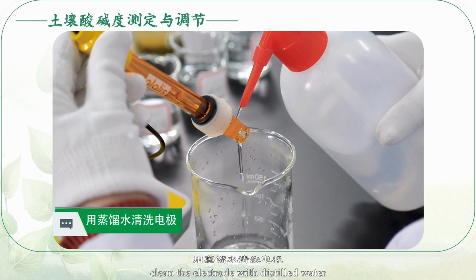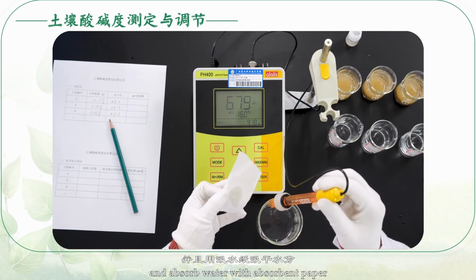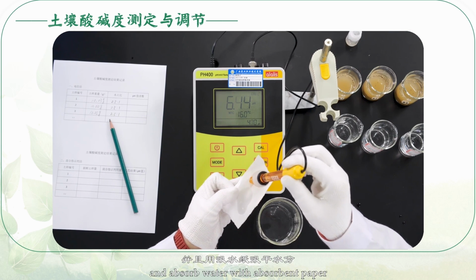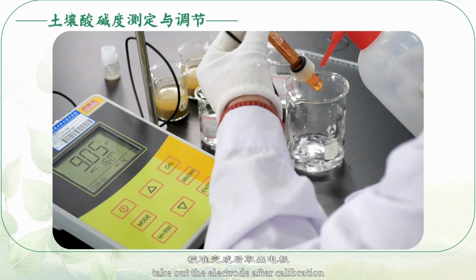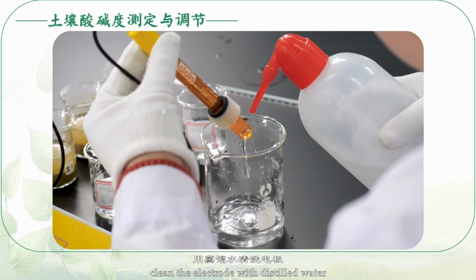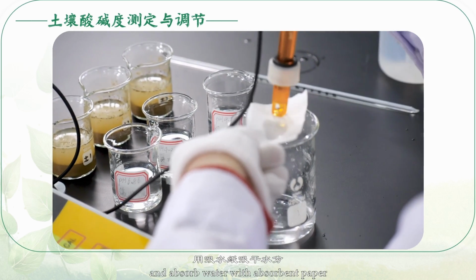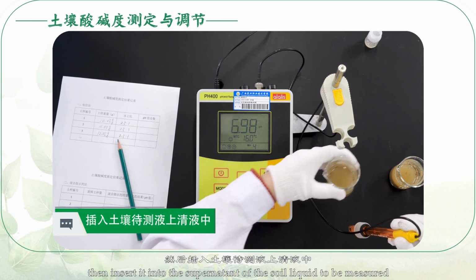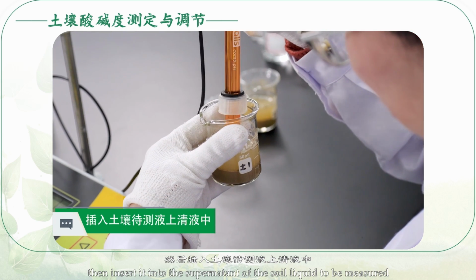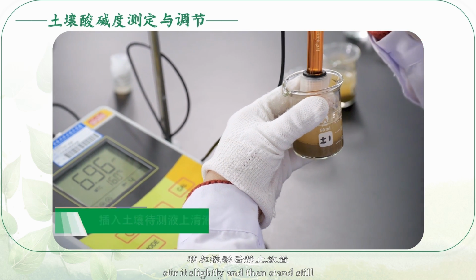Clean the electrode with distilled water and absorb water with absorbent paper. Take out the electrode after calibration. Clean the electrode with distilled water and absorb water with absorbent paper. Then insert it into the supernatant of the soil liquid to be measured. Stir it slightly and then stand still.